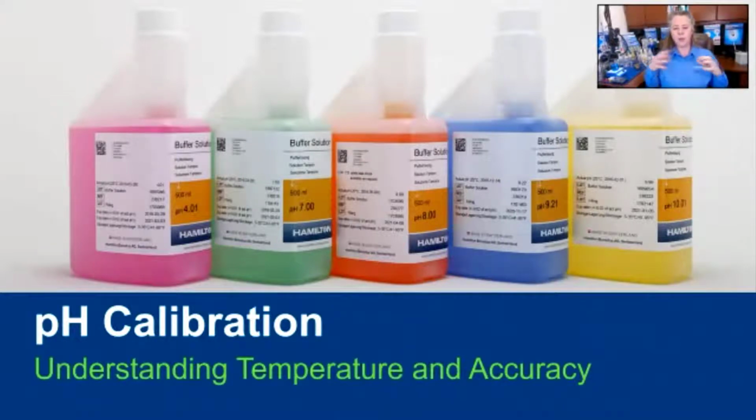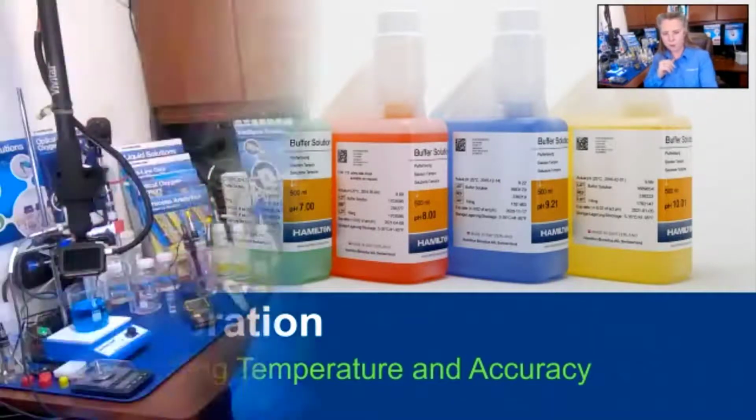If you've ever looked at your laboratory probe, and say you have a laboratory meter that's pretty smart, and you do a quick calibration, it may be a pH 4 and a pH 7 buffer, and you get a little printout that says the slope of your pH is this and the offset is this, and you write that down and keep notes on it. How is slope calculated and how is offset calculated?